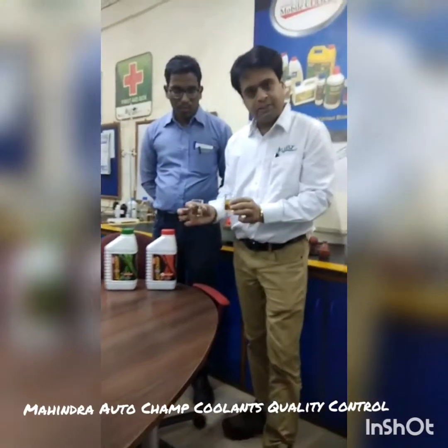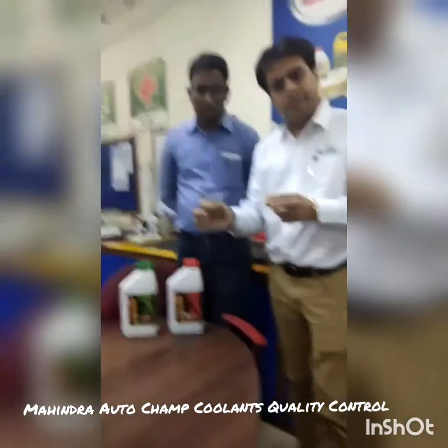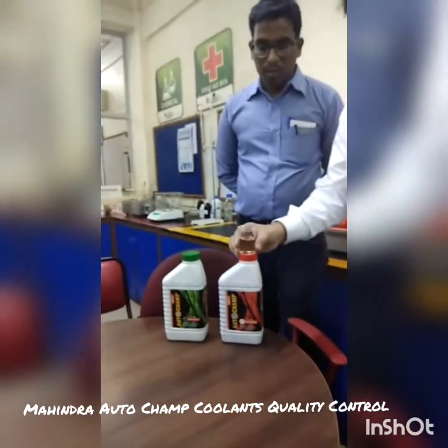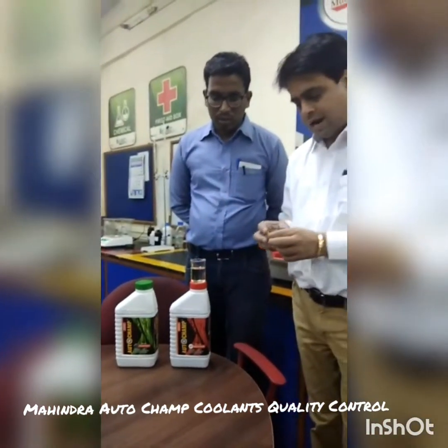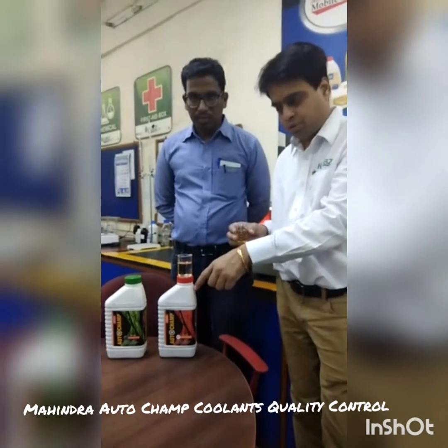These are the two acids which go into manufacturing of the additives. This acid is called 2-EHA. 2-EHA is the ethylhexanoic acid which goes into manufacturing of this red coolant, and it is used to prepare the additive which is used to produce this product.